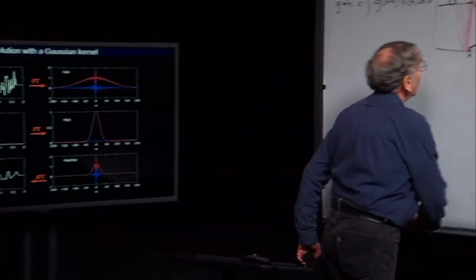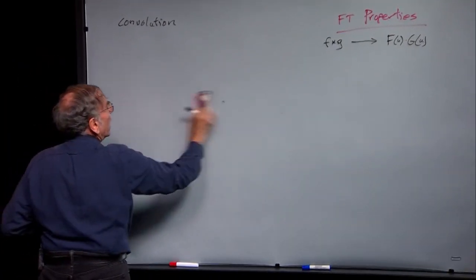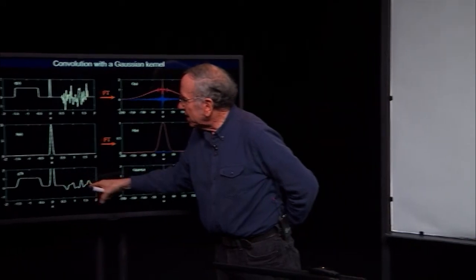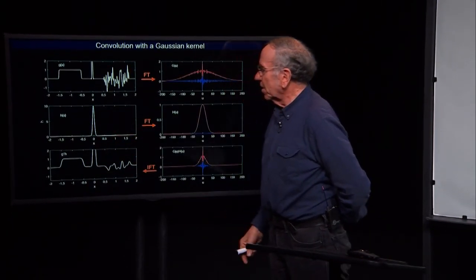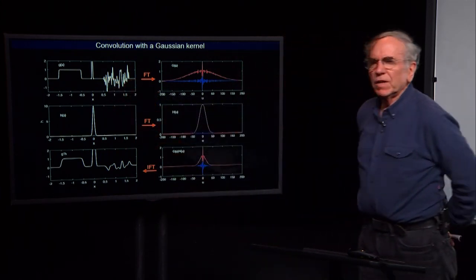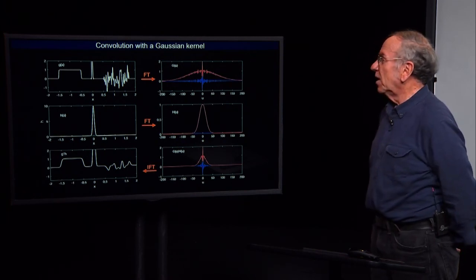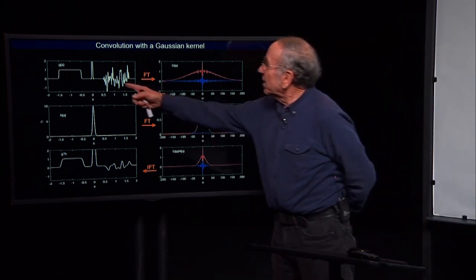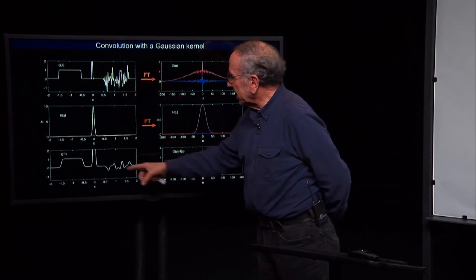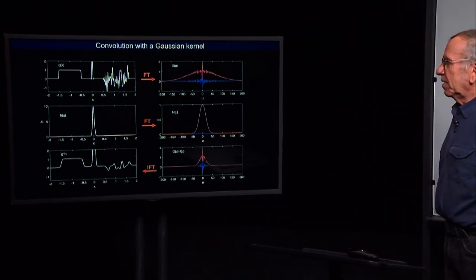So now that we know about this theorem, this raises a very interesting question, which is, can we undo a convolution operation? Suppose I gave you this function, and I told you that's the kernel. Would we be able to reconstruct the original function? So that's, in general, a difficult problem. It's not always solvable because, just think about it, we have to reproduce all of the zigs and zags of that original g of x from this heavily filtered and smoothed output function.